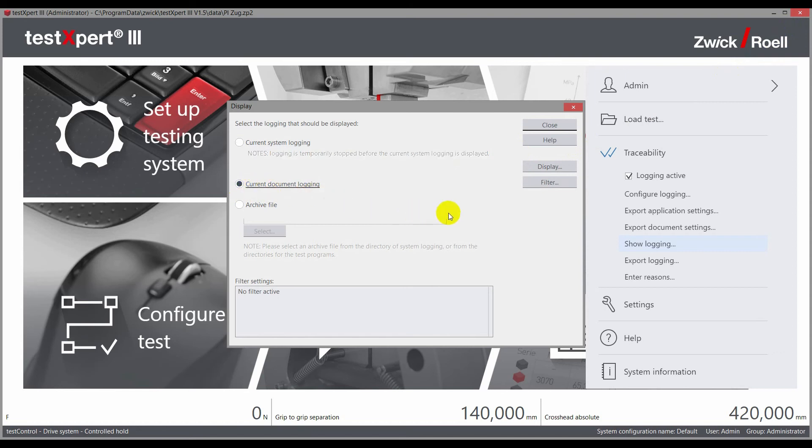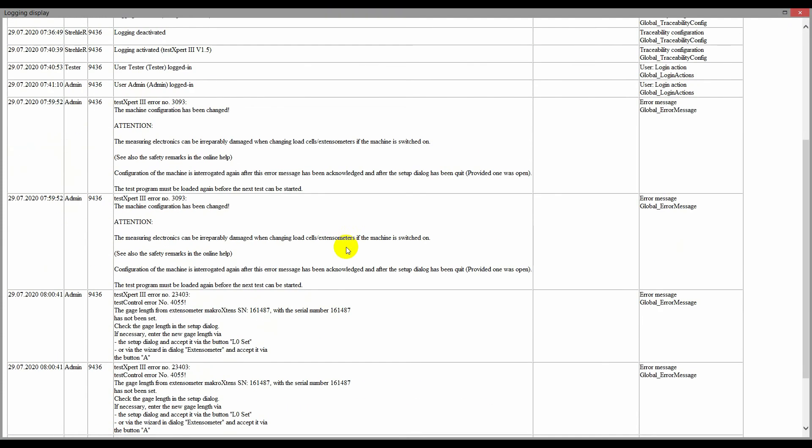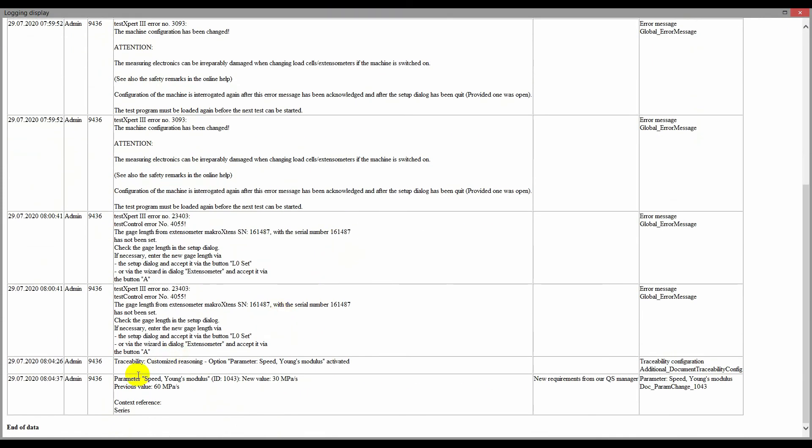Document logging displays all actions within a test program, and therefore also the modification of a parameter.